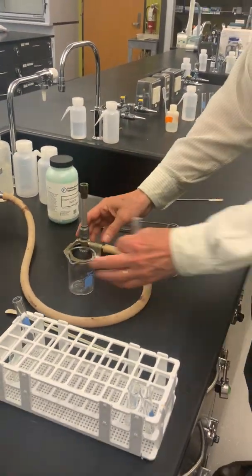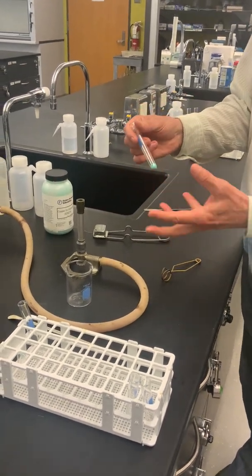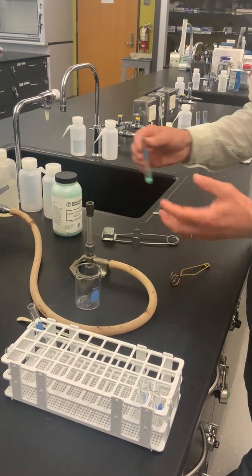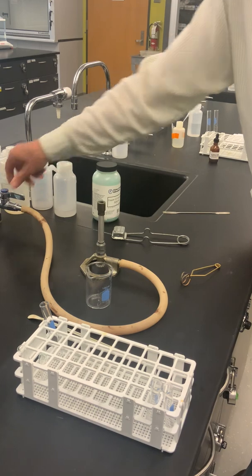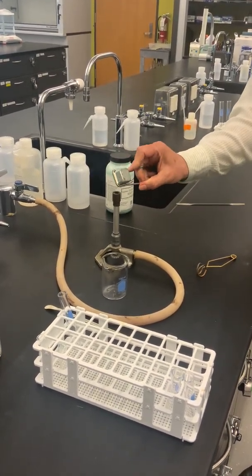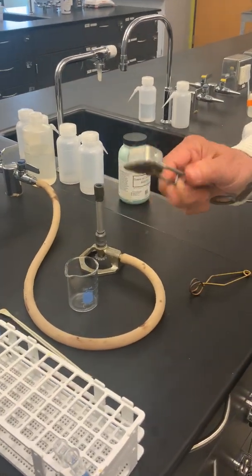Because decomposition reactions often require energy, that is to say, they are not rapidly spontaneous, I'm going to use heat, as we often do in chemistry, to speed up that chemical reaction. Here using the lab burner and the striker.